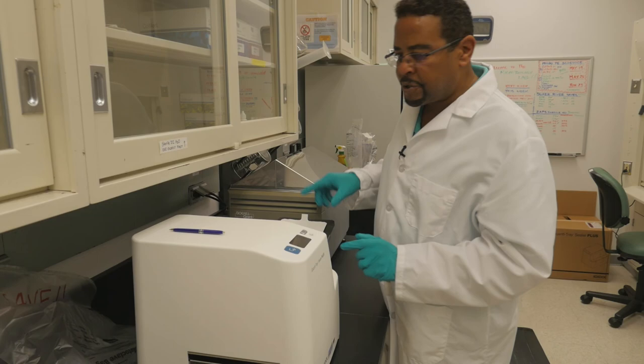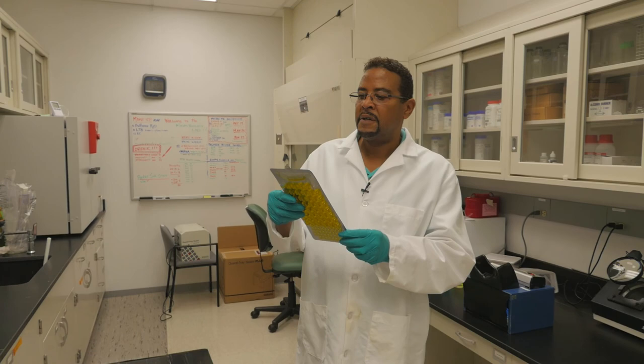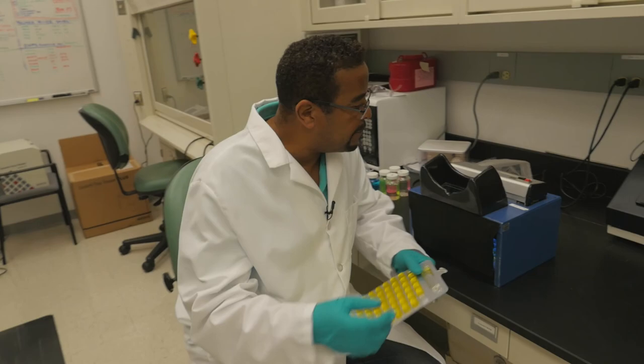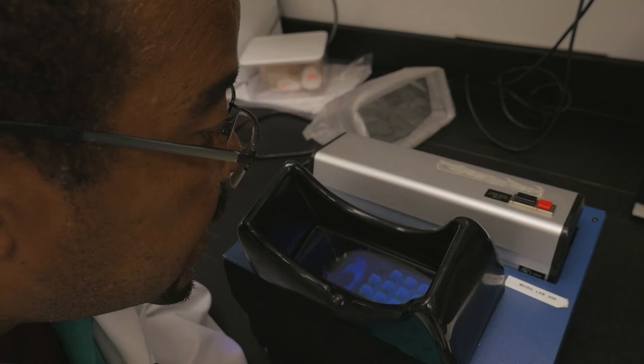Once it goes through the sealer, I'll be putting it into the incubator at 35 degrees. And if it turns yellow, like this, that means bacteria is there, but it doesn't mean E. coli. So I would have to go further and check and see if anything is fluorescent. And we do have some fluorescent wells, which means positive for E. coli.